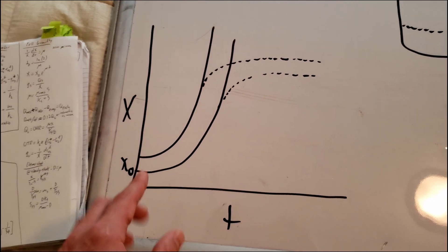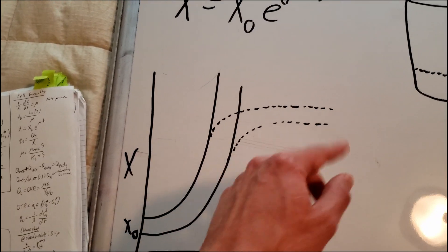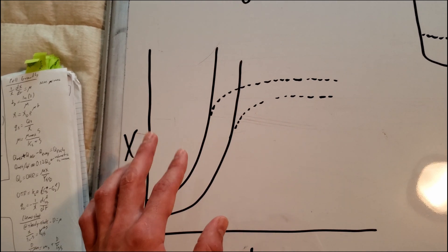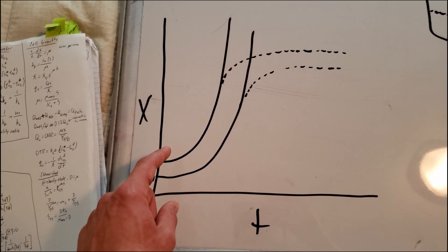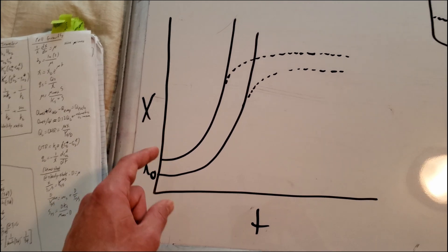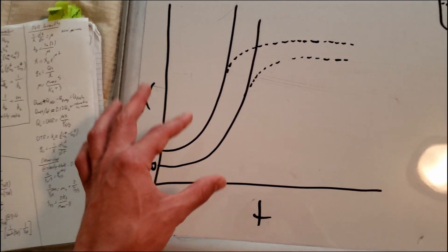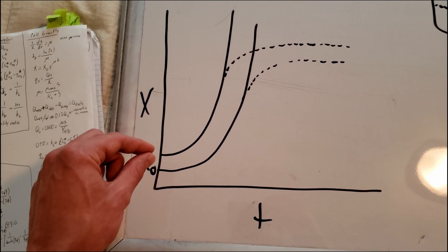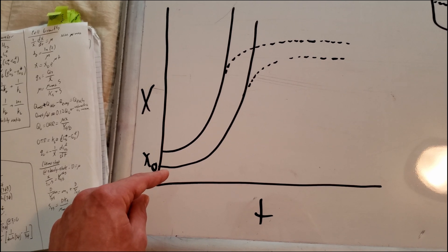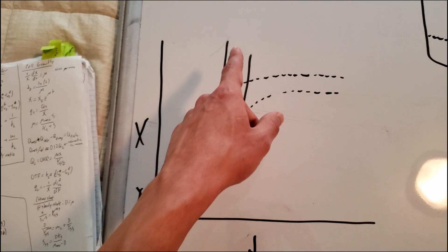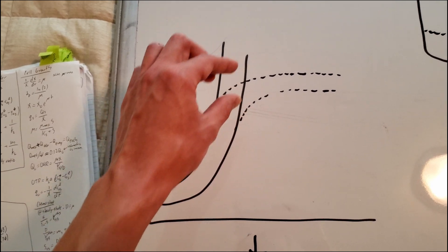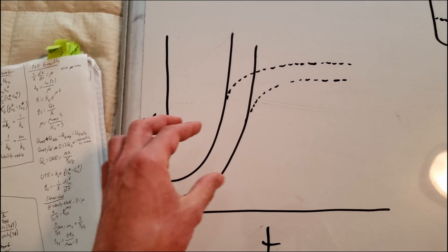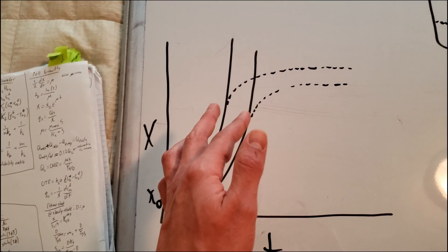When we graph this, of course, we get something that looks exponential. So don't look at the dotted line for a second. Here's our exponential graphs. And they're going to be exactly the same except our X naught is going to be higher in our batch reactor because we started with more cells. But the shape of the graph is going to be the same. So the only thing that's changing is that the graph is shifting up with the batch reactor relative to the fed batch reactor. So you can see that as time goes on, this gap doesn't really close very much. And you could graph this yourself and it might look a little bit different, but the gap between them isn't going to close very much.